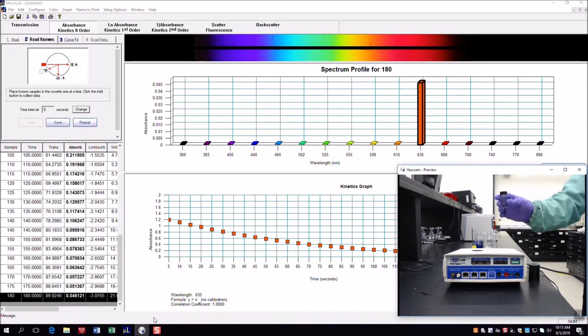This, as you can tell from our data, has an absorbance of below 0.1. If you were to wait, you know, 30 seconds shaking it like crazy and trying to be really good about mixing it and then putting it in, you'd be losing a third or more of your data, and that's no good because you'd end up with a clear solution and not usable data. So you want to make sure you get that in nice and quick.